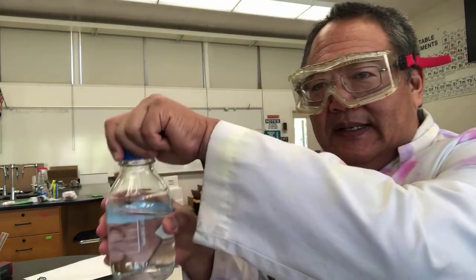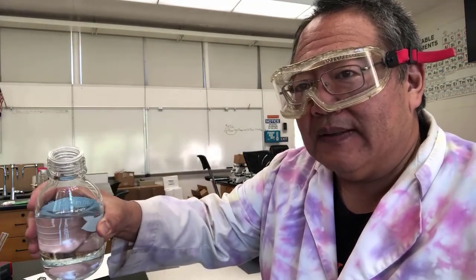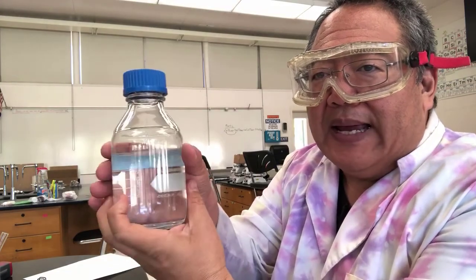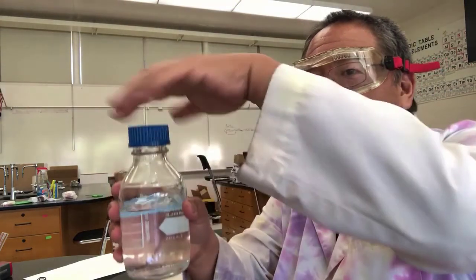Now, when we pour, and this is like a house rule, like Monopoly has house rules, this is a house rule. You open this up, set the cap aside somewhere clean. I typically set it to the side on top of another piece of glassware, but sometimes I just hold it. And then you pour like this. But you'll notice where my hand is. It's on the label. I put my hand on the label, I double check to make sure it's the thing I wanted, and then I open it up. And then I pour it into whatever container I'm going to be taking it in, okay?